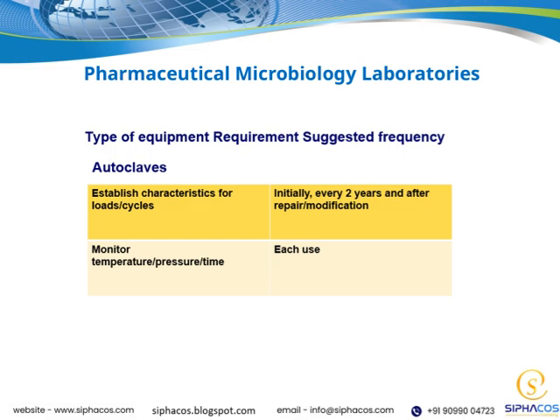They are specialized facilities dedicated to testing for microbial contamination, which is vital for safeguarding patient health. In these laboratories, we perform various microbiological tests to detect bacteria, fungi, and other microorganisms that could compromise drug safety. It's important to highlight that these labs adhere to strict regulatory standards and good laboratory practices, or GLP, to maintain accuracy and reliability of results.